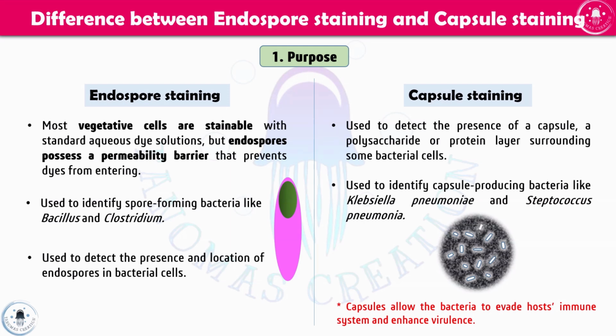In our previous video, simple staining versus gram staining, the methods were different: one was simple and one was differential. Whereas in this video, we talk about two differential staining methods used for different purposes. One is endospore staining, another is capsule staining.